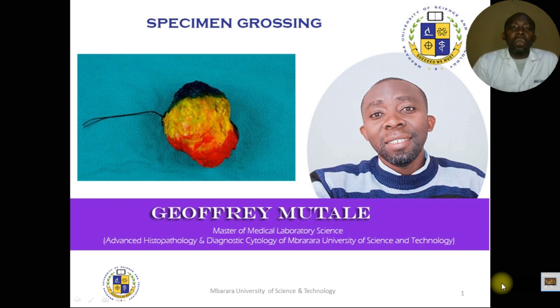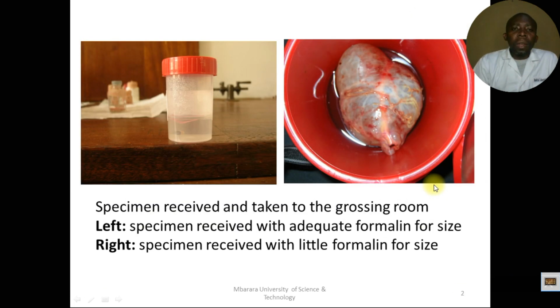So today we are going to discuss specimen grossing. What is grossing, what is done in a grossing room, what we find in a grossing room, the importance of grossing, and other things as we shall continue to see.